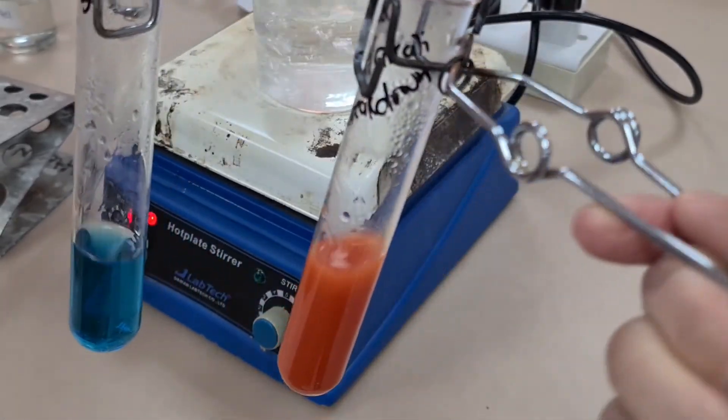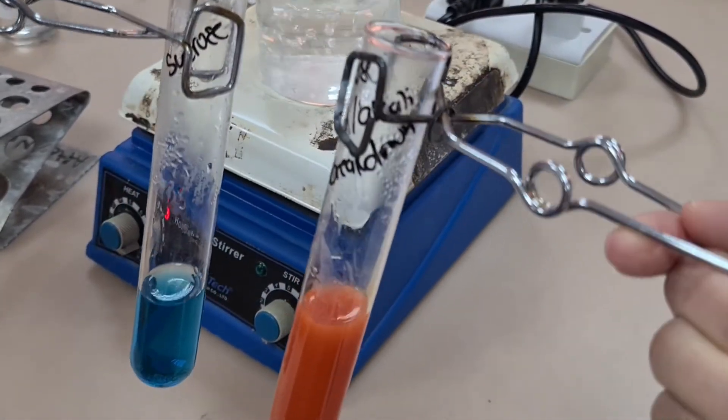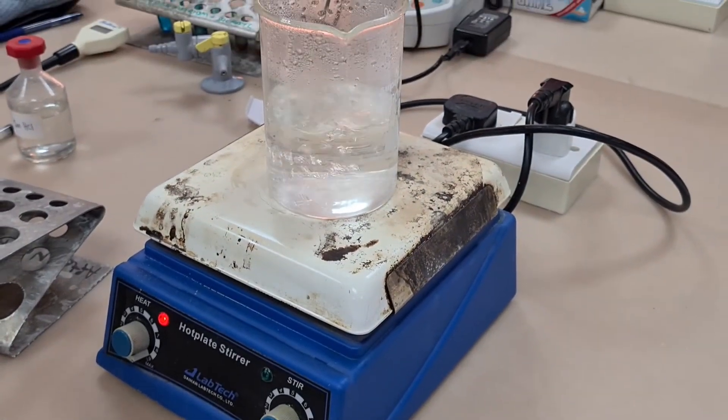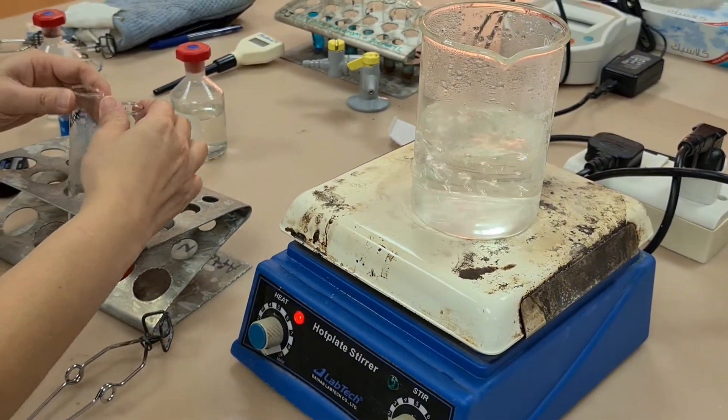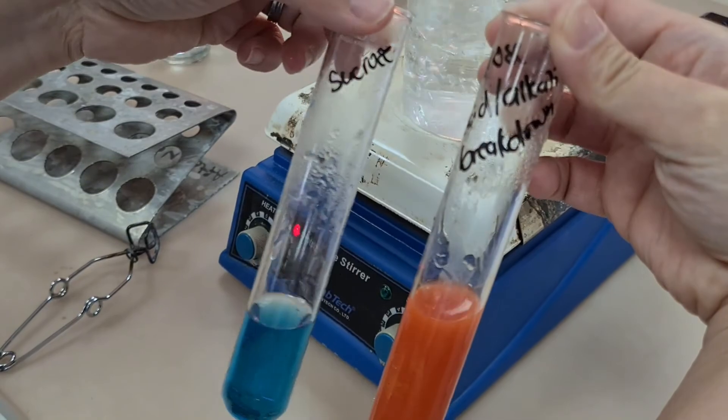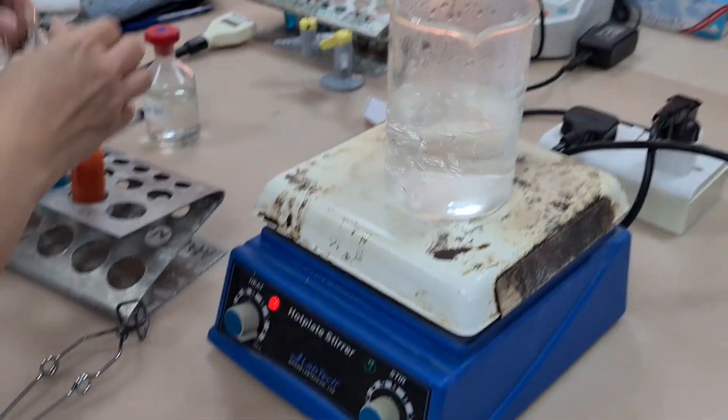So to test for disaccharide, we have to prove first of all that we get a negative test, then we have to break it down into monosaccharides, test again with Benedict's reagent, and get a positive test.